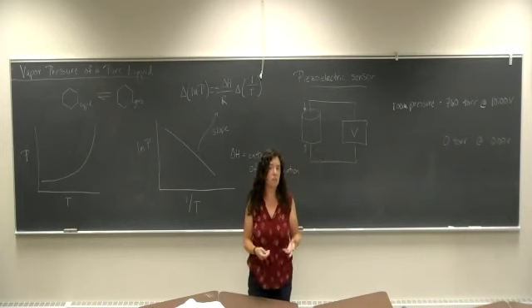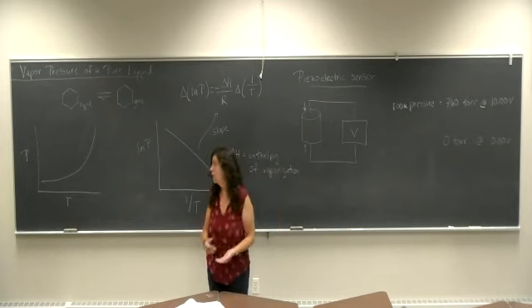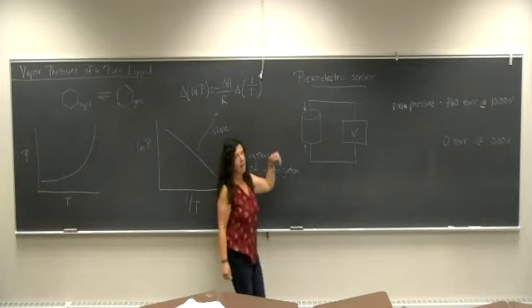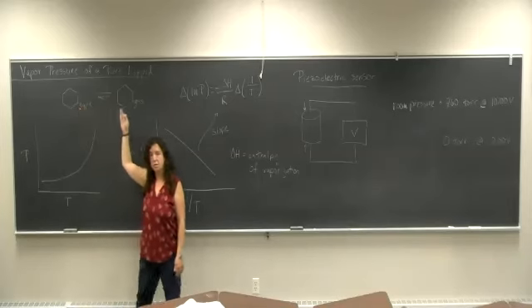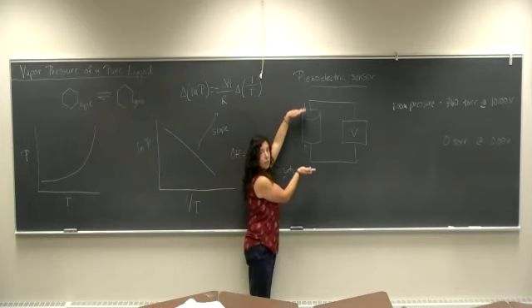So then this vessel is going to be placed in a beaker of water where we can then monitor the temperature. And we'll slowly increase the temperature of the vessel. And then for the piezoelectric sensor, as our cyclohexane goes through the phase change, particularly from liquid to gas, the pressure in that sensor will increase.